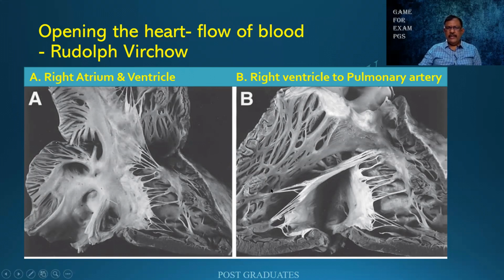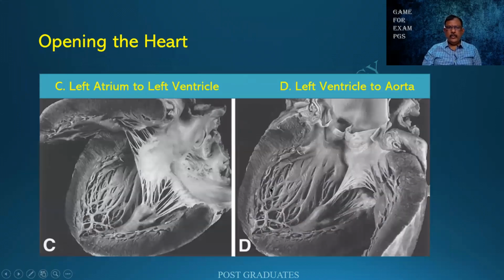So the right side of the heart is open. The next will be between the pulmonary veins. I put an incision, open up the atrium. And also I'll be cutting along the lateral border of the ventricle so that I'll be able to see the mitral valve over here. Later on I cut through the ventricle and go into the aorta, so that I'll be able to see the aortic valvular cusps. I can examine the ventricles and also the chordae tendineae and the papillary muscles, the thickness of the ventricular wall, etc. So this is the classical and the most logical method of opening the heart.